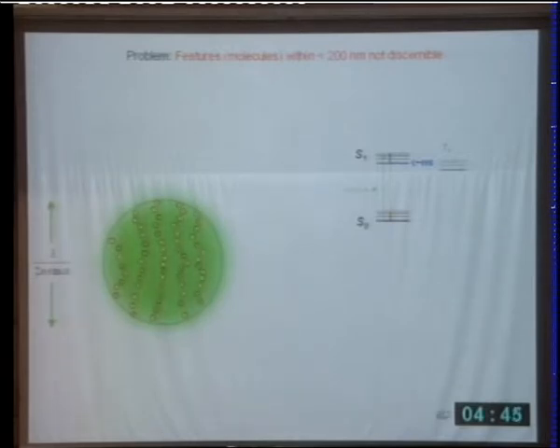Well, one way of saying it is because we cannot concentrate the excitation light any further. If we could concentrate the excitation light further, as in near-field optics, we could concentrate, for example, the excitation light just on that strand, and then we could see that strand, and later on that strand, and so on. But in far-field microscopy, in a focusing light microscope, this is not possible. All of the features will be flooded at the same time with excitation light, and hence give off light at the same time, scatter light back, fluorescence light back, and so no detector will be able to tell these features apart.